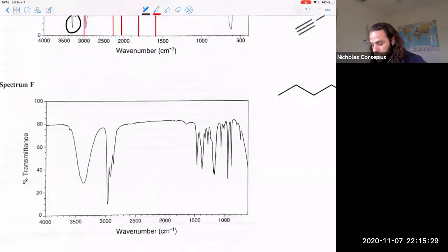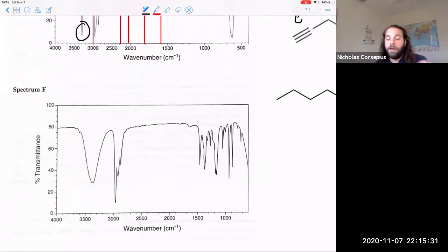And then the last one here, hopefully right off the bat, something jumped out at you. And that's this portion of the spectra right here. What does that signify? A broad peak between like 3300 and 3500. This is just this characteristic alcohol signature that we get here.